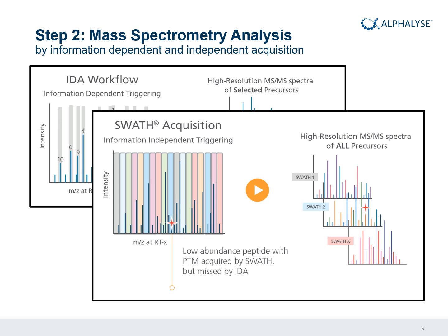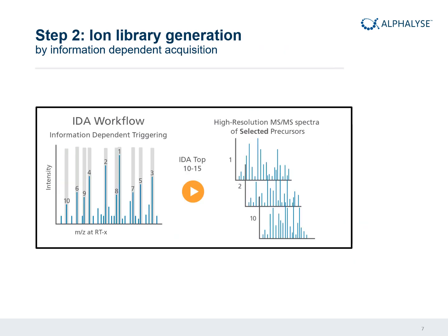The disadvantage of this method is, of course, that now you don't have just a single peptide in each of the MS windows. You might have signals from more than one peptide. And this, of course, makes it more difficult to read the data and do identification and quantification of individual peptides. We overcome that by building up an ion library that can search these more complicated data. I will come back to that.